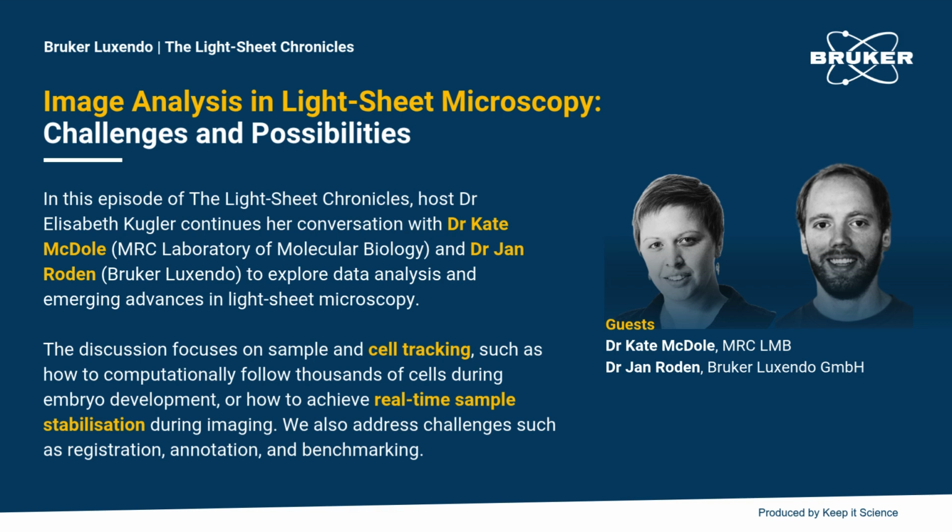I guess another approach is, instead of storing all the raw data, storing some already segmented data that is smaller, some form of representation that is more compact. But then, of course, you have the problem that you never know what you want to do with the data in the future. And if you delete the raw data, maybe it could have been useful for some other kind of analysis that you hadn't foreseen in the past. So it's always this pickle that you are in. I don't know a good answer to that either, of course.